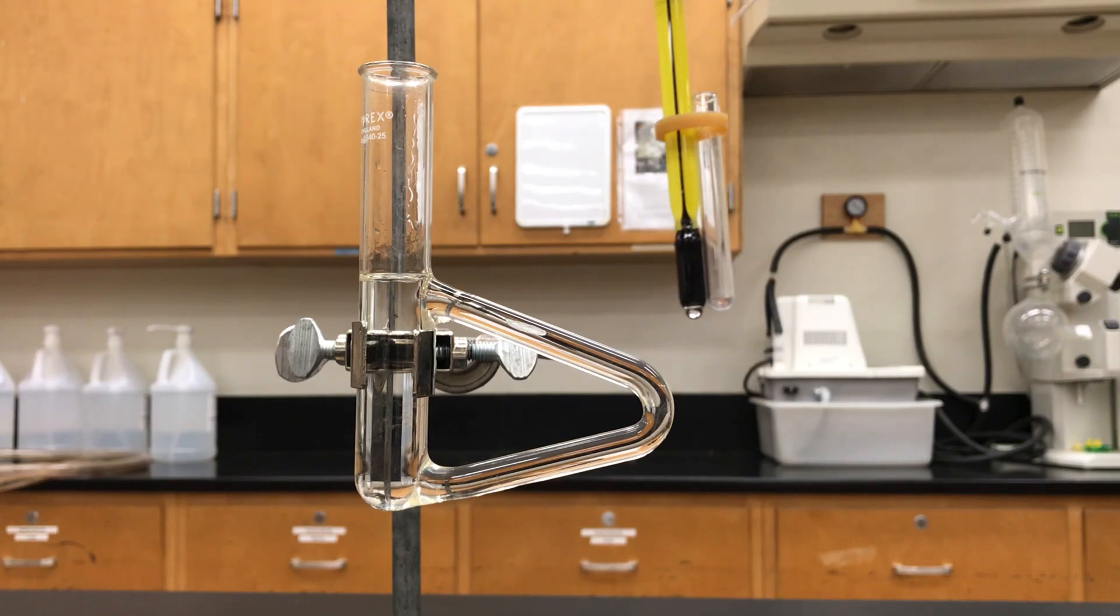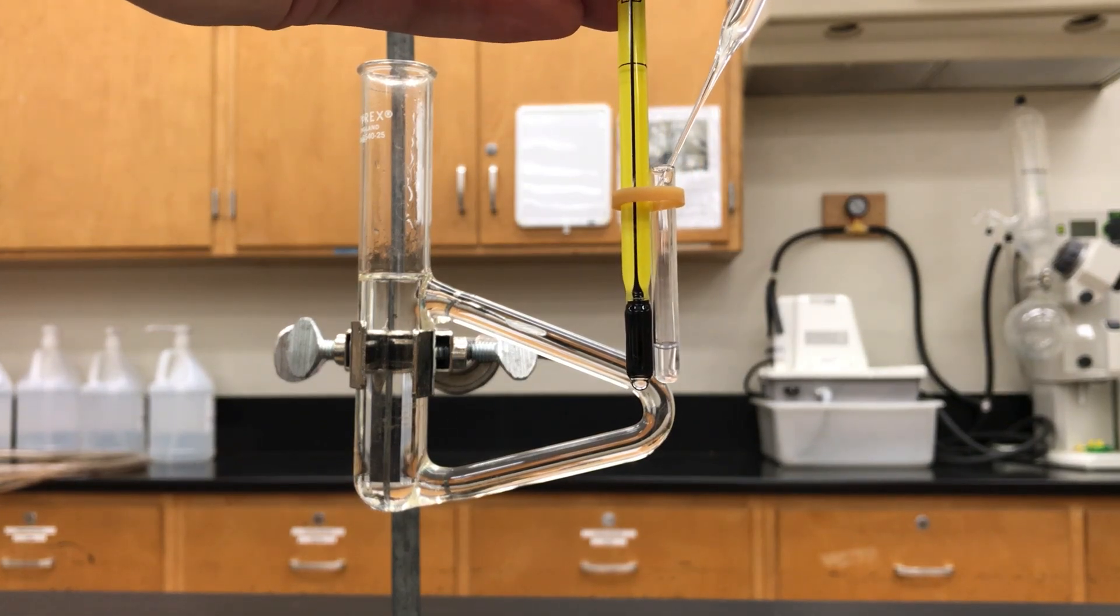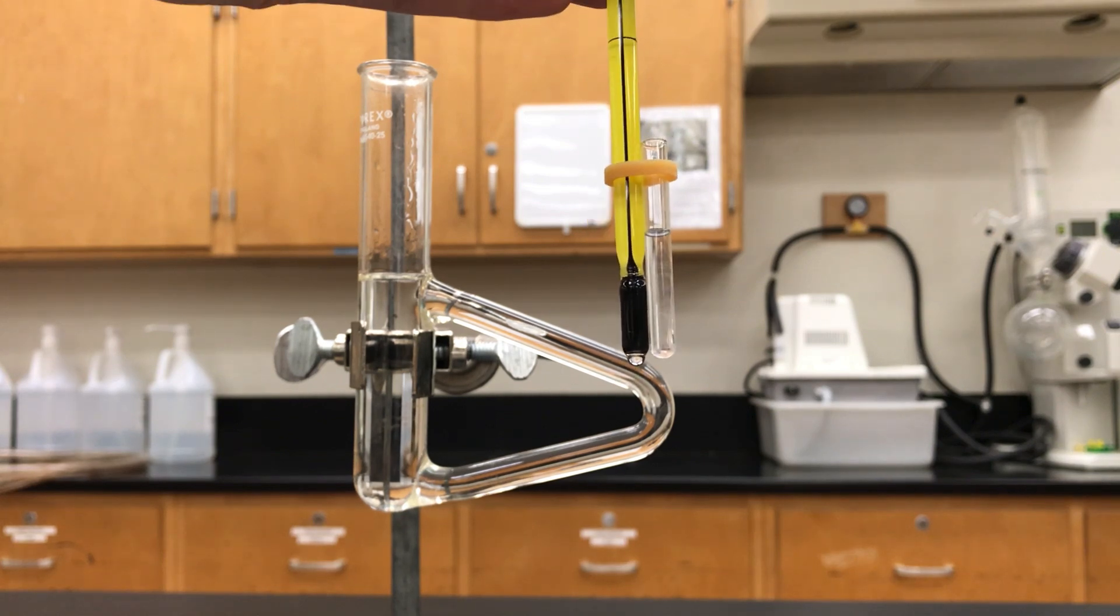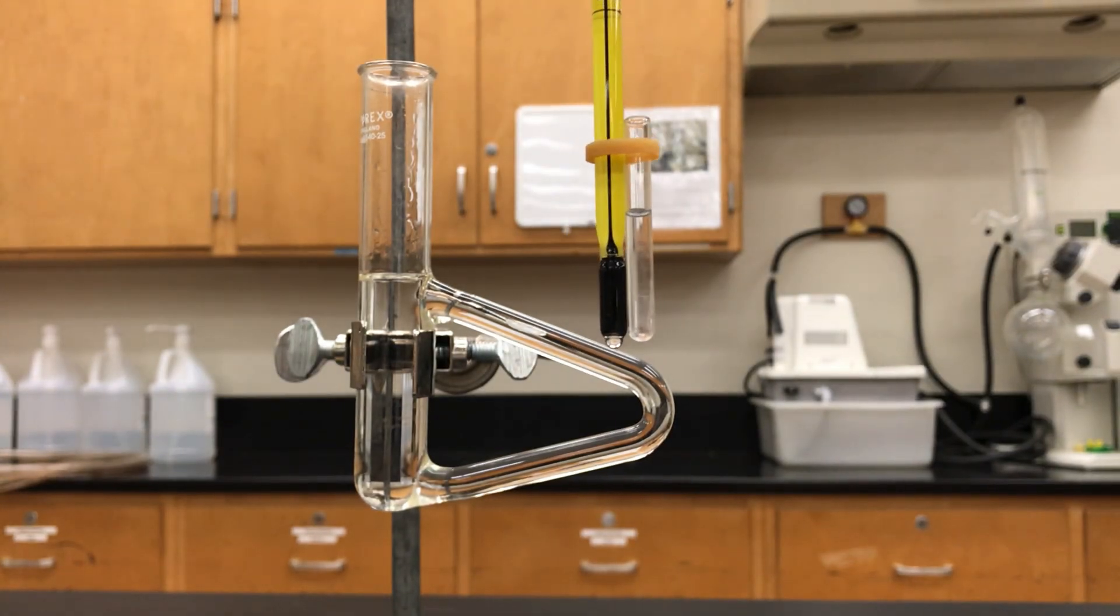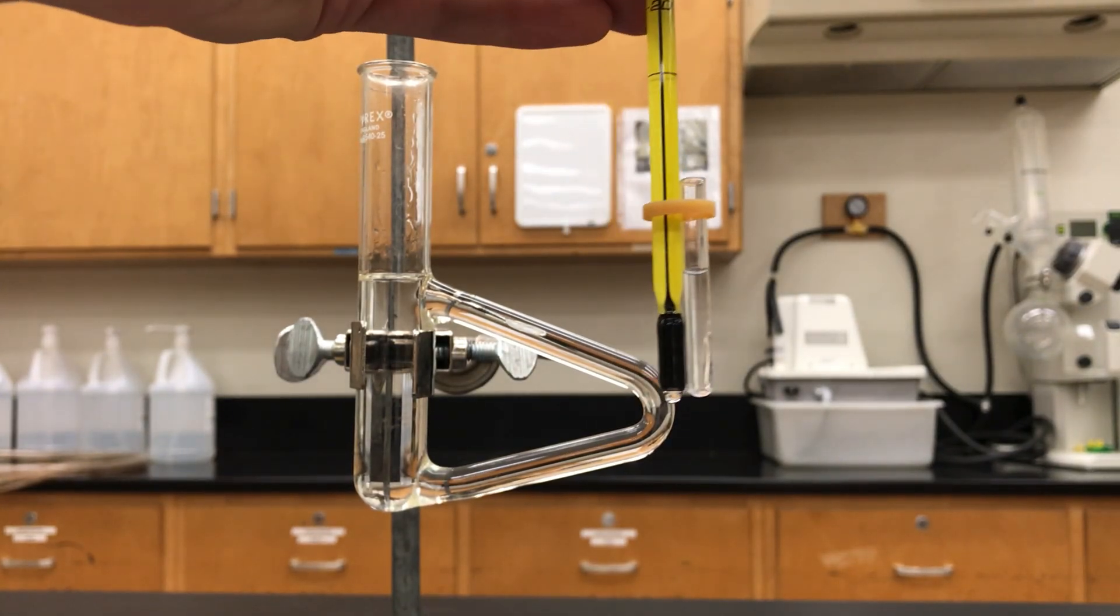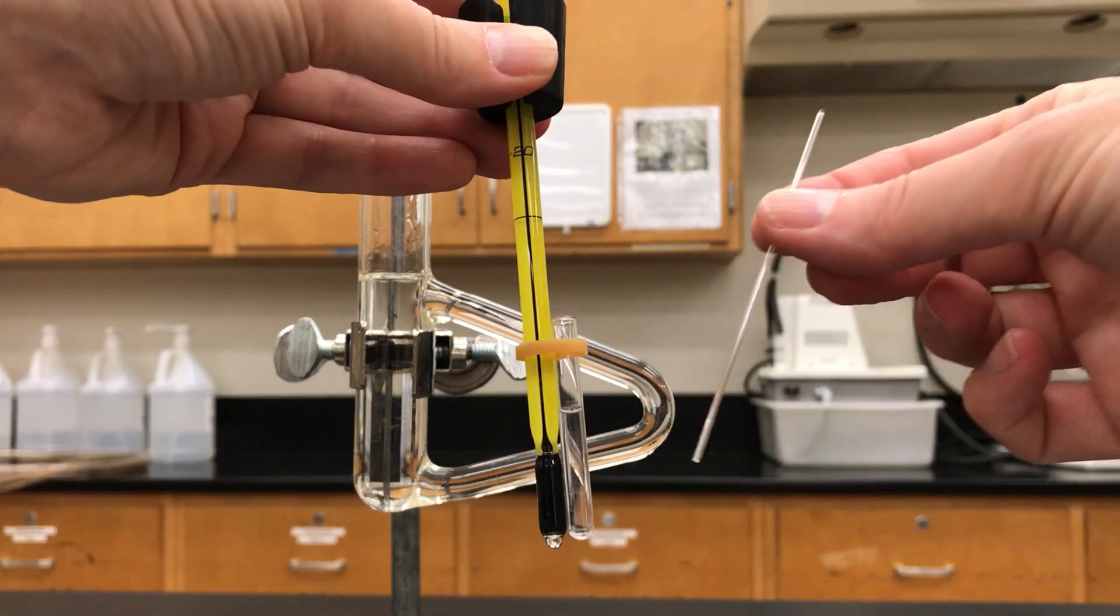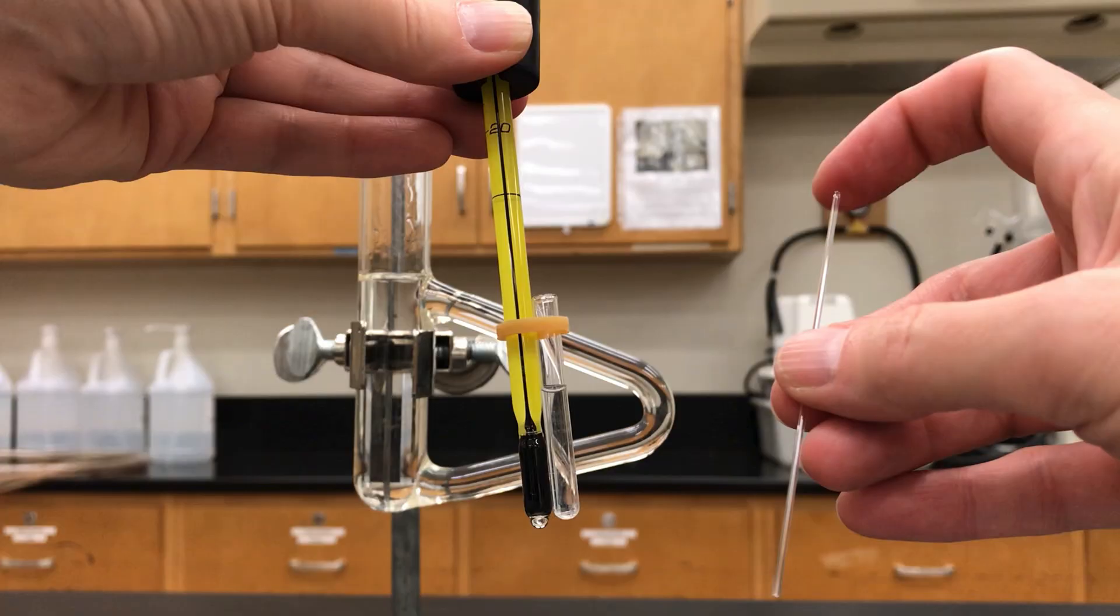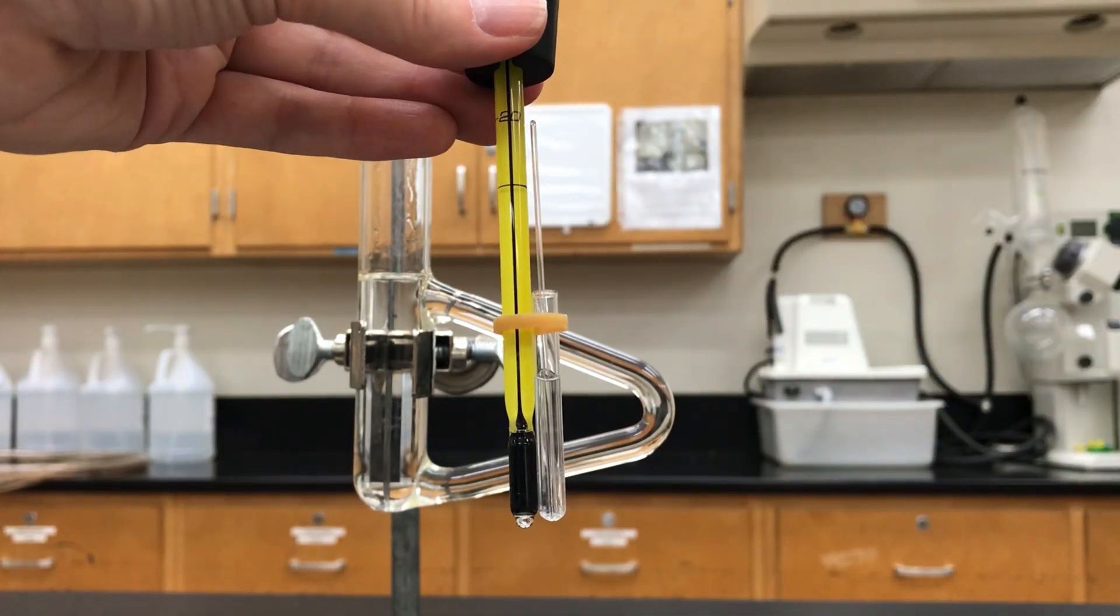And next you want to take the liquid that you want to analyze its boiling point of and add that to the Durham tube. Fill it up roughly between a half and two thirds full. And then you're going to take a capillary tube which is open on one end and sealed on the other end and put it into the tube with the open end down. The sealed end should be on the top.